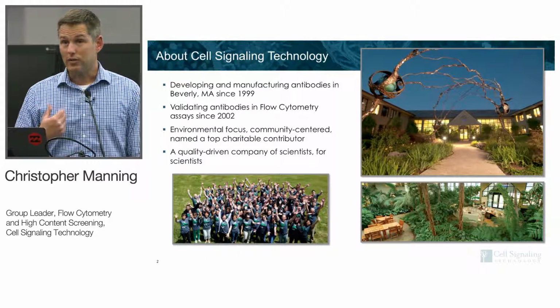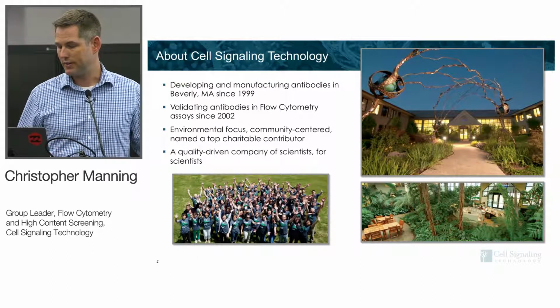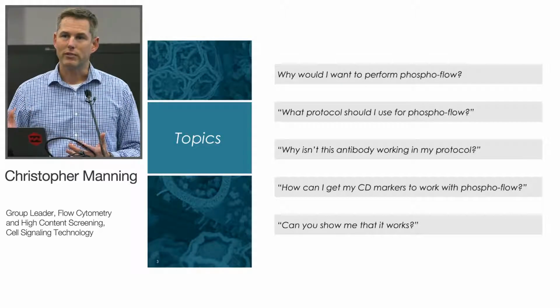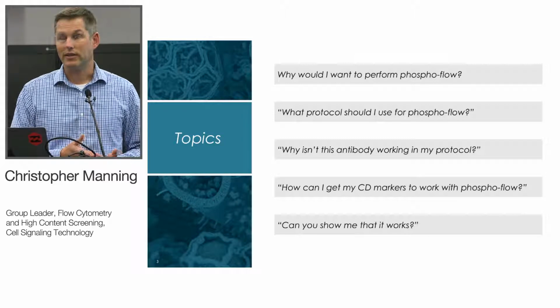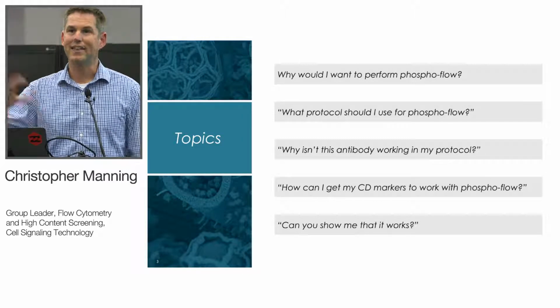As a result, we see what those common problems are, and that's where this workshop grew out of: seeing these problems that arise and wanting to answer some general questions that people have regarding detecting phosphorylated proteins, and more generally, just performing intracellular flow cytometry, detecting anything inside the cell.